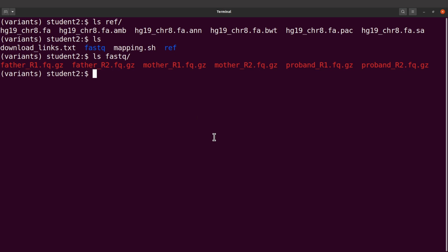If you are going to write a script to deal with multiple samples, then there are things you have to factor in. You have to factor in the names, and this is where a good naming convention comes in handy. And if you are dealing with paired-end reads, you also have to factor in the pattern that you use to differentiate between the forward and reverse. So in this case, we have this.